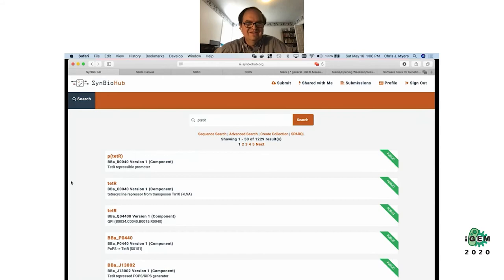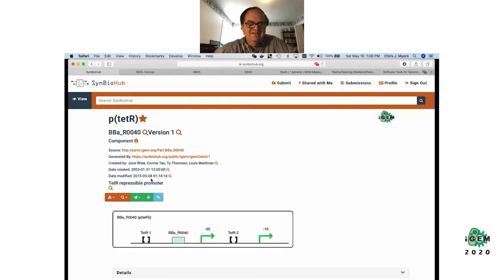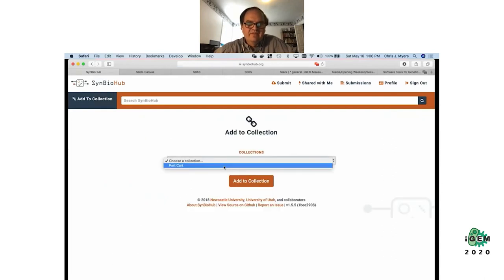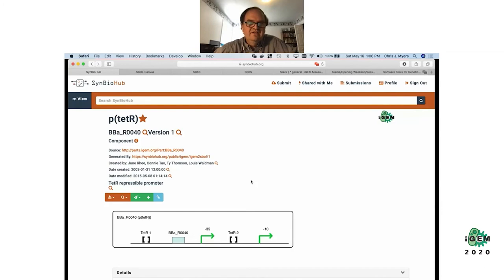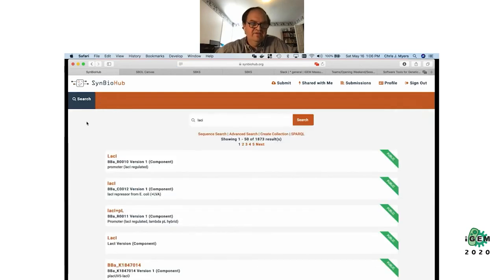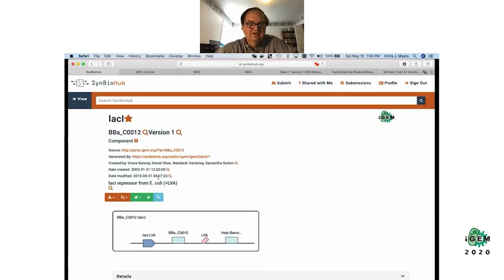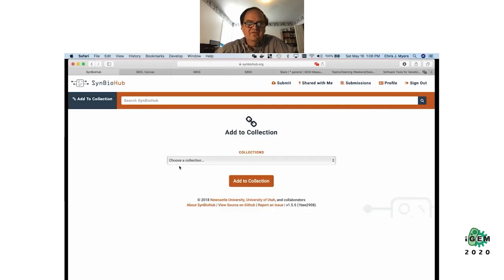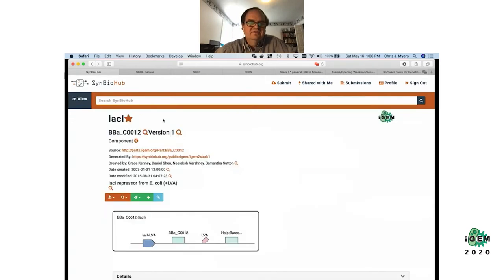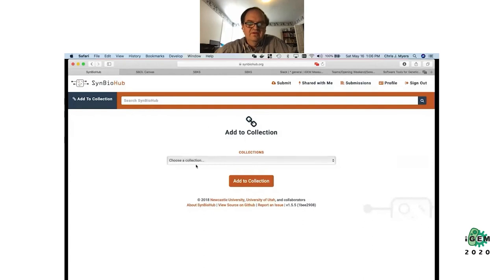There we go — pTet — and the last thing I need is the LacI gene. Normally you'd probably open several pages and try to find the one you're really looking for, but I know what I'm looking for so I'm going to add that one to my cart.